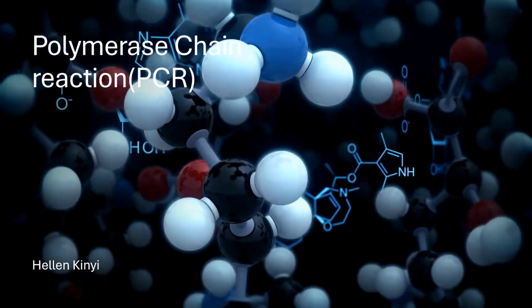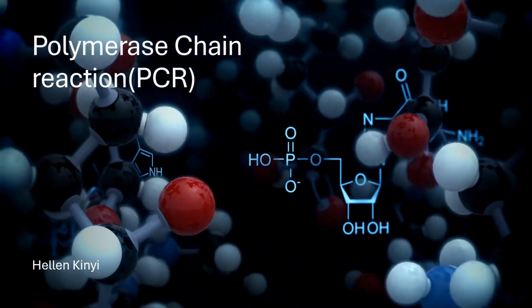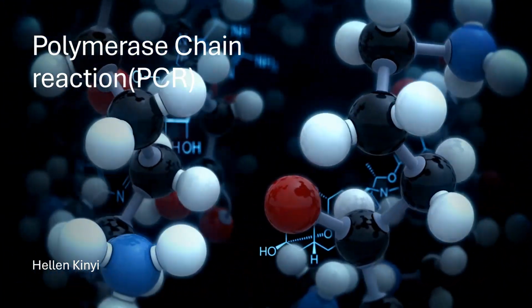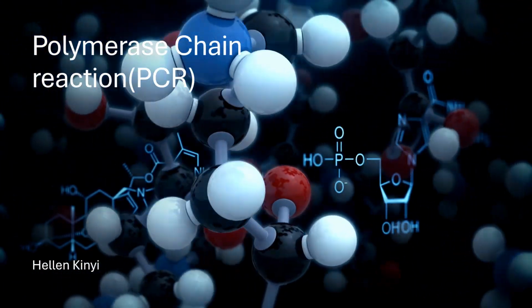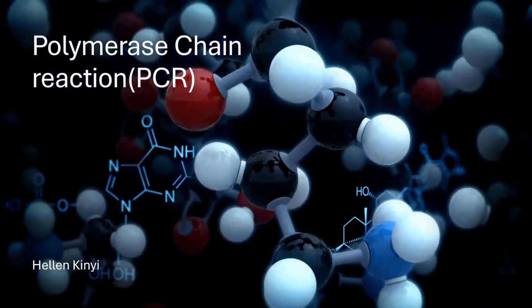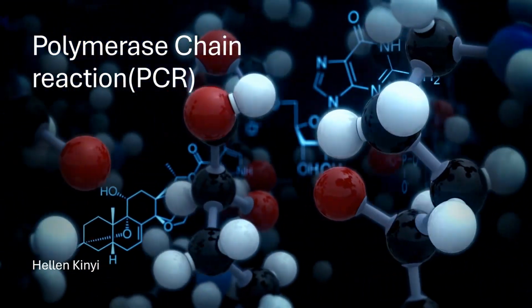Hello, welcome back. In this lecture, we're going to look at the polymerase chain reaction, or PCR. I know when we started learning about biochemistry, I promised you we must learn about PCR and its importance in medicine. And PCR has come to the forefront. I know for us in medicine, we knew it for HIV, paternity testing, but now it's come to the forefront a lot because of COVID-19.